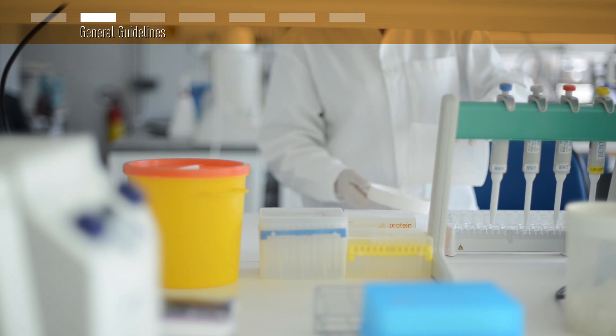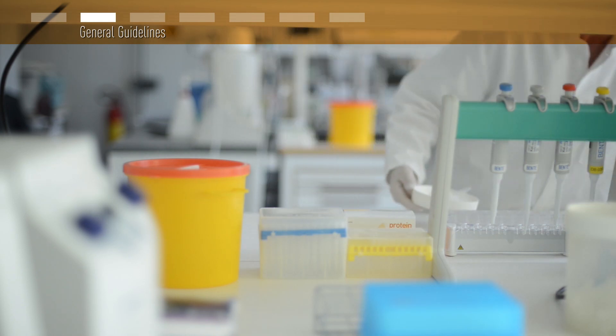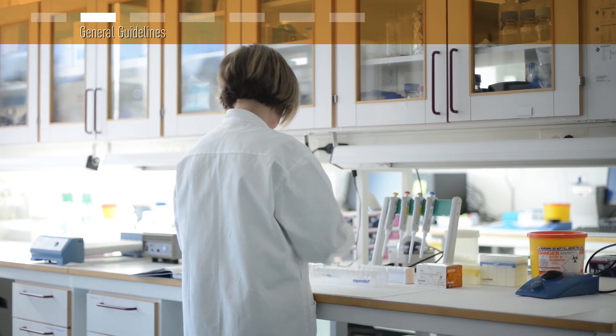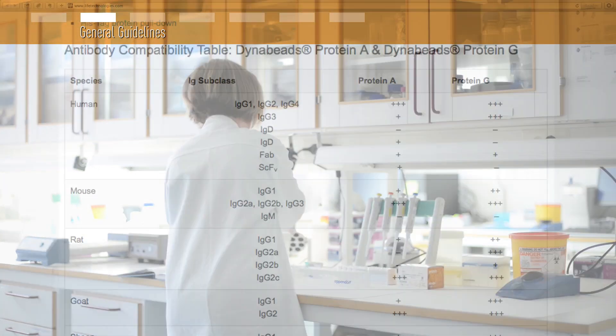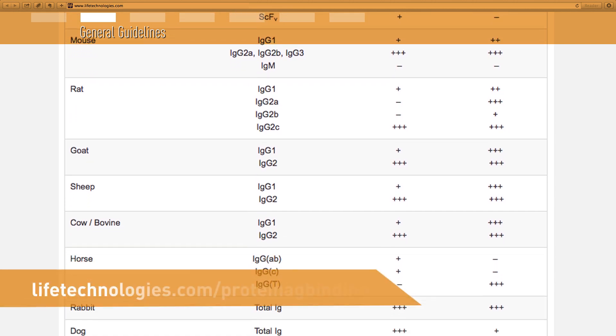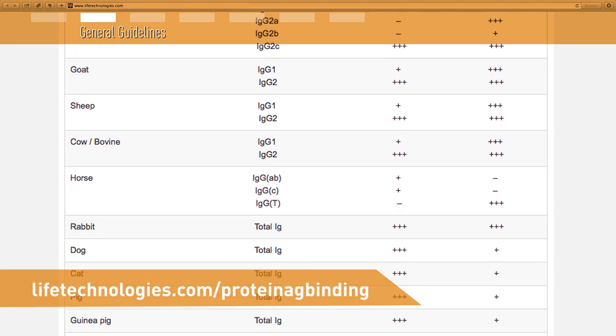Before you start, you need to decide if the DynaBeads with protein A or protein G are best suited for your assay. This will depend on the type of antibody you are using. You'll find an overview of binding strengths of different antibodies in the product manual and on our webpages.